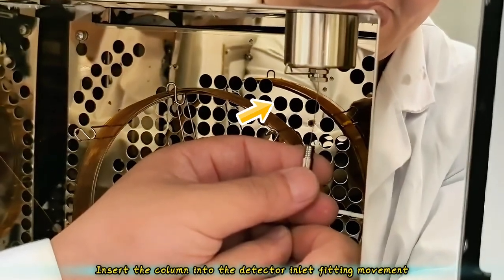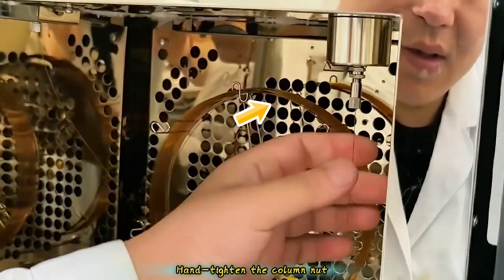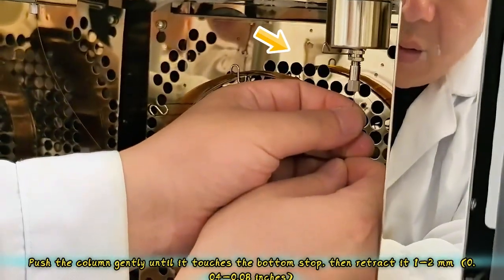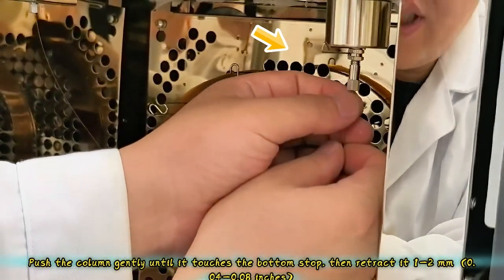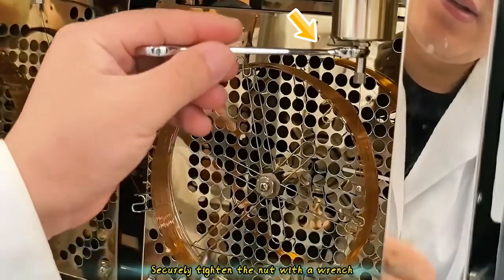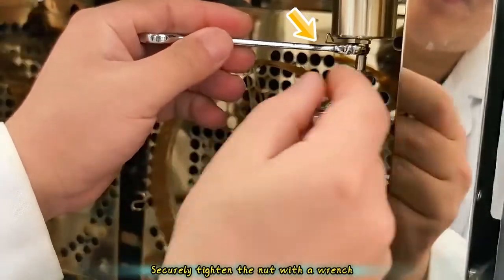Insert the column into the detector inlet fitting. Hand tighten the column nut. Push the column gently until it touches the bottom stop. Then retract it 1 to 2 mm (0.04 to 0.08 inches). Securely tighten the nut with a wrench.